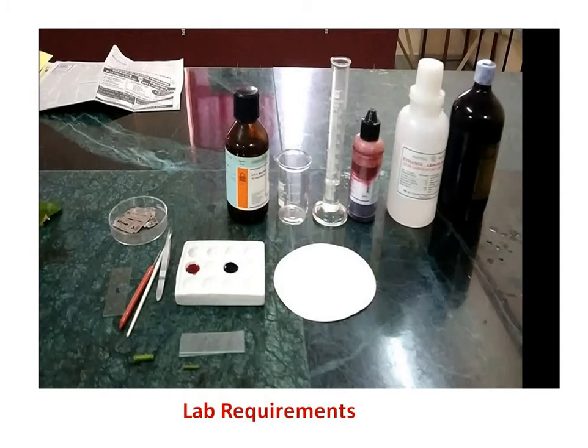For the anatomical purposes, we have to cut very thin sections of each specimen, that is leaf and stem, taken separately, and each of them is transferred to the double staining process and observed under the compound microscope and their anatomical characteristics noted.